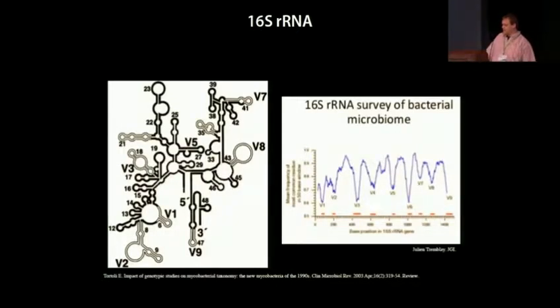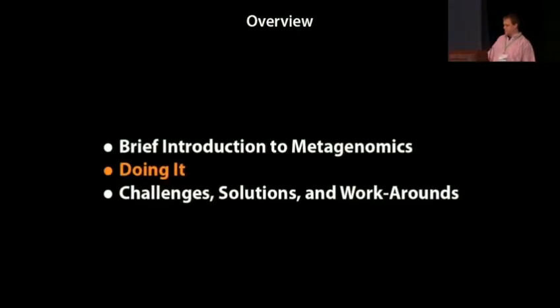The reason that 16S is used often, and sometimes 18S in other instances, is that while this gene is highly conserved, there are some hypervariable regions that allow us to differentiate organisms within the sample. In particular, the study that I'm working with used regions from the V4 variable region.